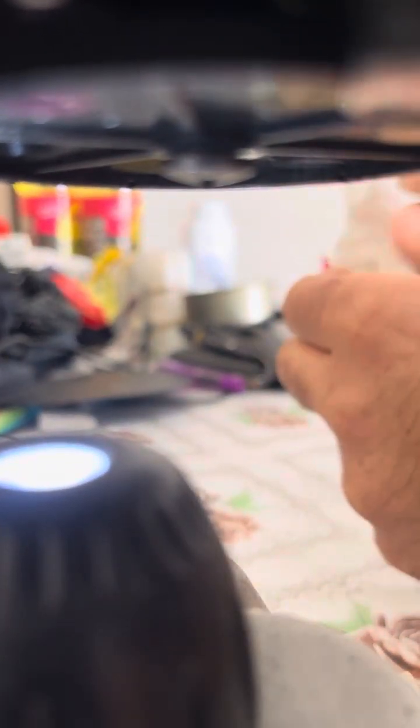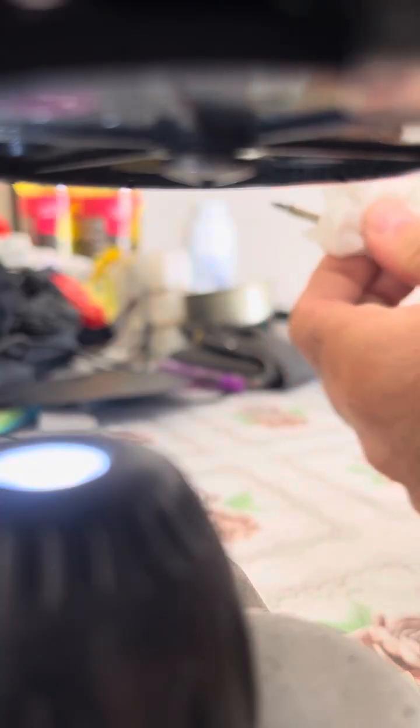So I've taken one sample from the ocean of oil, and another sample from the more hardened layer from the top, for example. When I do the examination more rigorously, I write a legend of each of the slides, but I didn't do it now because it wasn't that important.